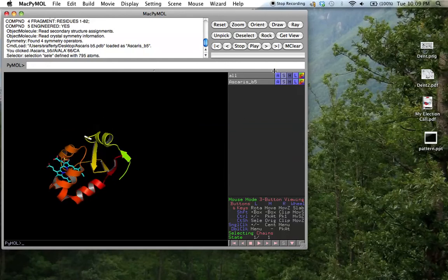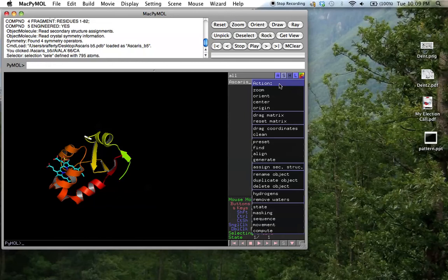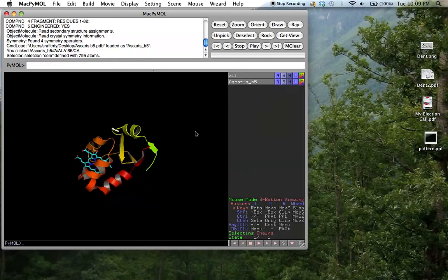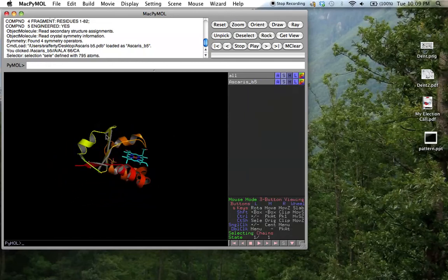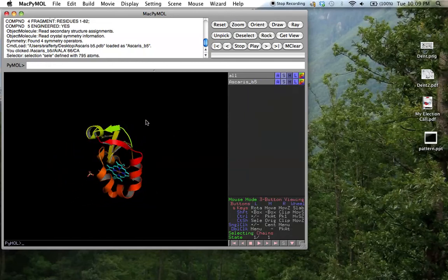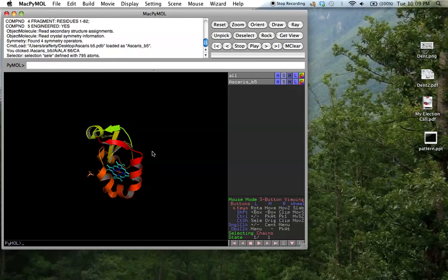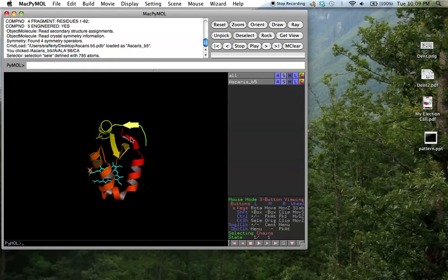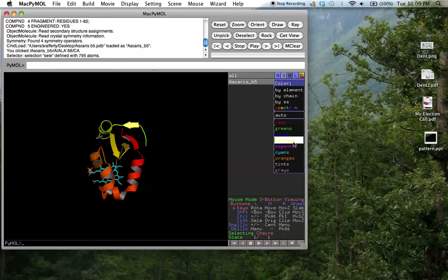Now all we have left is one copy of that protein. So we just go to the action button again, click on center, and that centers it. Now essentially what we're going to be doing is displaying within this window both the Ascaris and the rat cytochrome B5, and we want a way to distinguish them, so we just change the color of this one so we know what it is. And so for the Ascaris, we'll just choose it to be yellow.